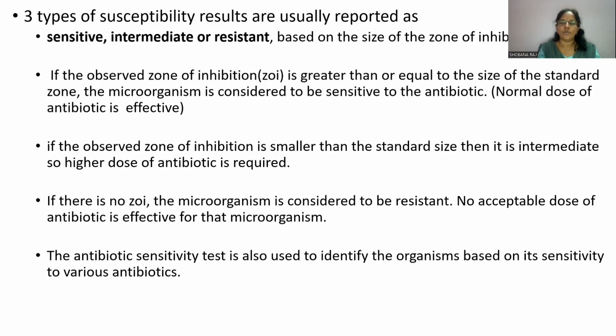And now you can watch the video and you can understand how the Kirby-Bauer assay method is performed in the lab using the antibiotic disc, by keeping the antibiotic disc on the surface of the agar lawned with pathogenic microorganism. Now you can watch the video.